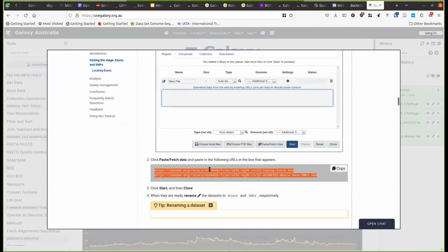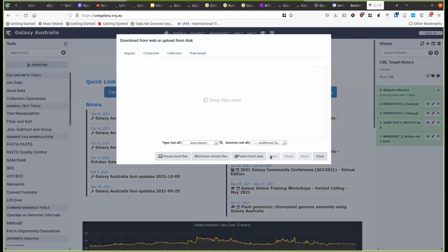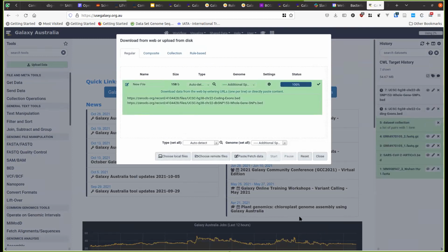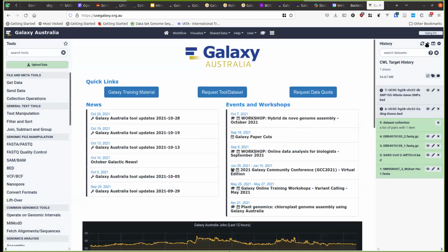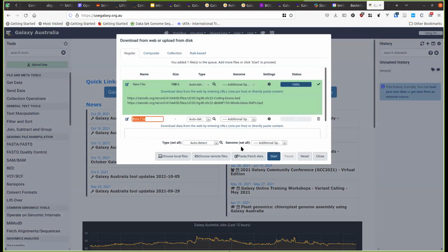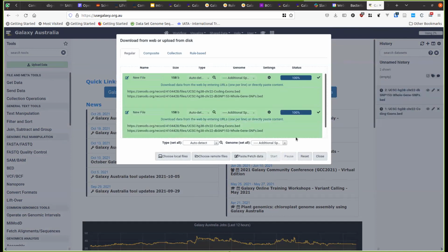Copy this. And I'm going to go back to my upload data thing. Paste, fetch data, click this, start. Oh, I didn't start on a new history. Sorry. Just do that again. Upload data, paste, fetch data, start. Okay, well, it was obviously the even older versions.